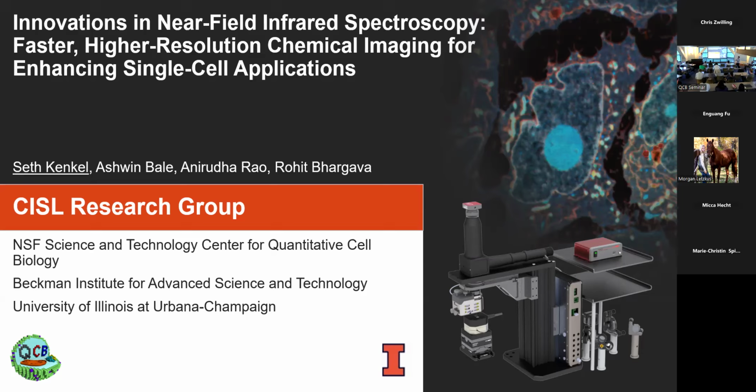I just wanted to get an update quickly because I saw at our last poster session you had some preliminary results for that. And I really just also want to emphasize that in these experiments, as in anything on biological systems, preparing the samples is so important.